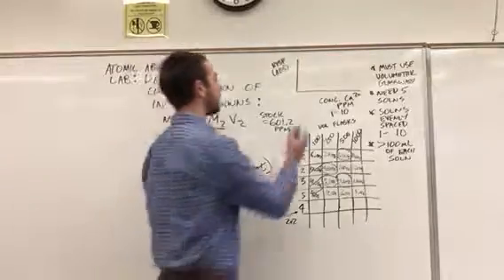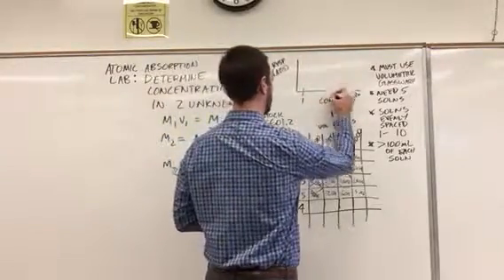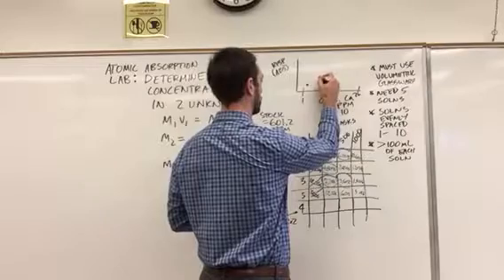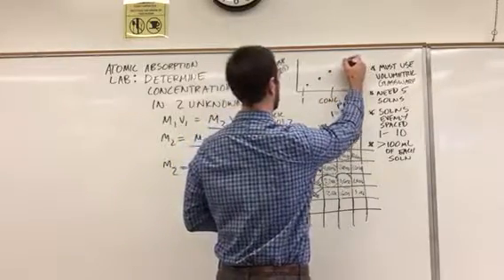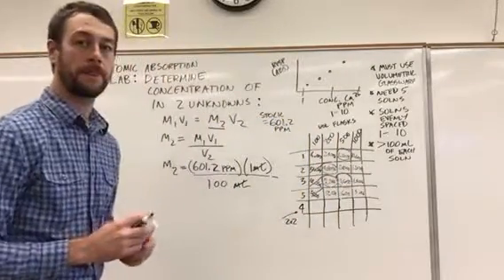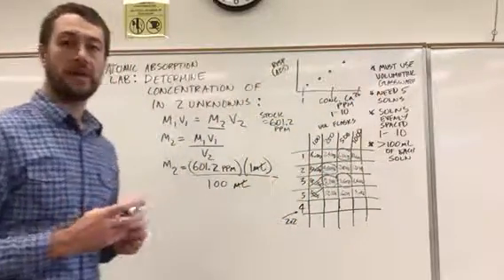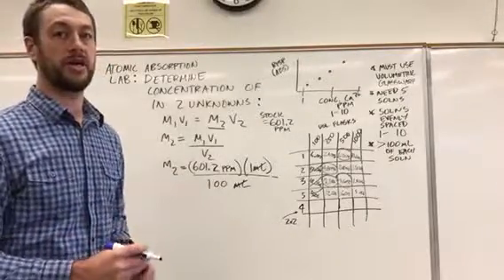So that would leave us with a curve where we'd have points here, here, here, here, right? But we wouldn't have a point close to the end, okay? And so it's worth thinking about, well, why does that even matter? Why do we want to have a point close to the end?